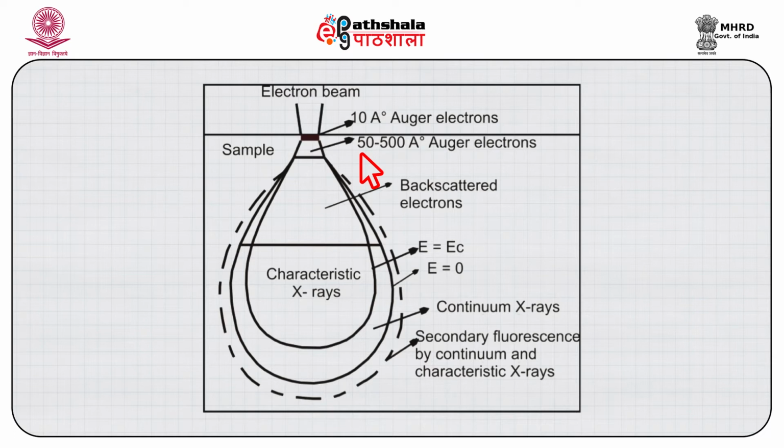That can also be used as a characterizing tool for material. So, several of these effects ultimately contribute to the complex result, and one can catch each of these in the form of an individual characterizing effect as a microscopy function.